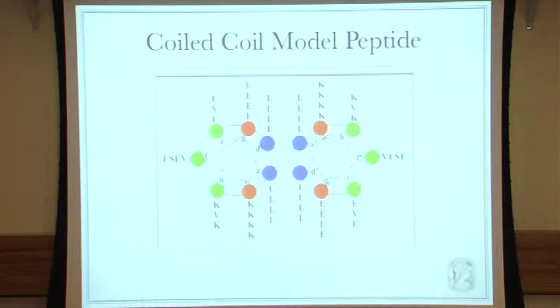So another possibility that I will show you today is concerning a coiled-coil peptide. This peptide is quite interesting. It seems really easy to work with, but it's not easy. It has 24 residues in length, but the problem is the repetition. So how could I know if I'm talking about these residues or these residues? They are similar. And what I did was to see which regions in my sequence are different, as the first step.